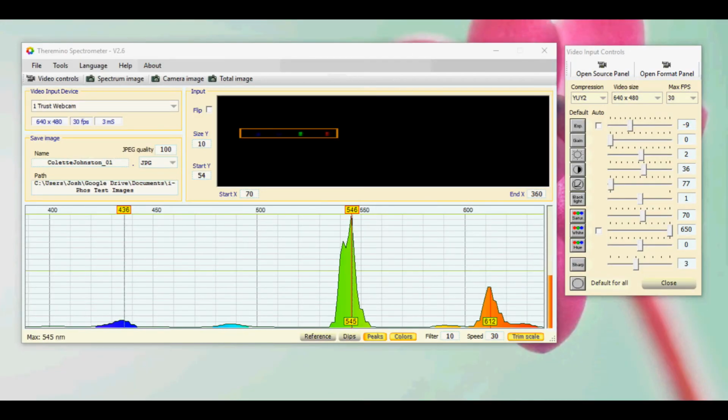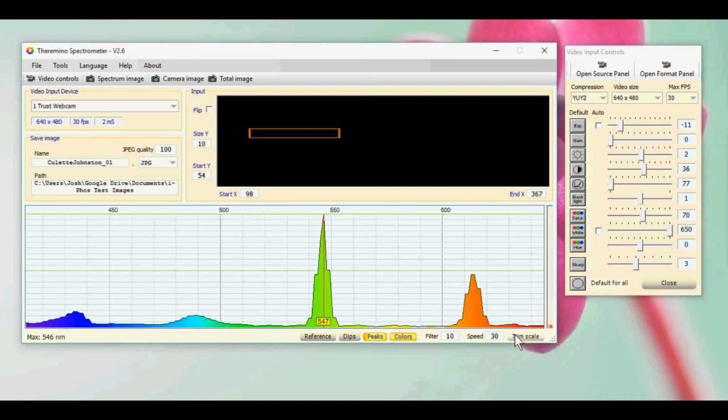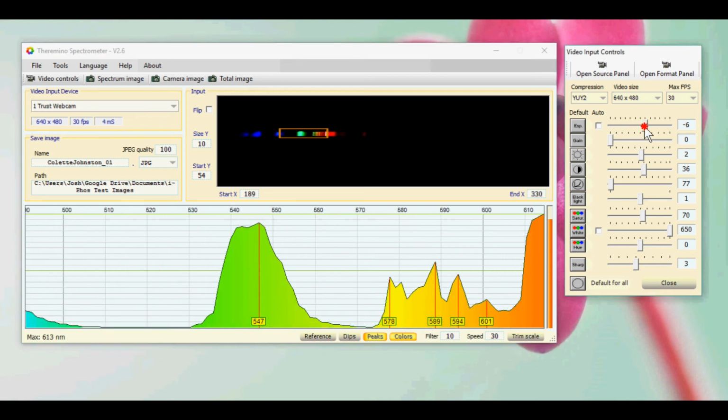So it's important that you line up on the mercury and not the terbium. You'll get an error of about 4 nanometers if you don't do that. That doesn't really matter much in the broader scheme of things, but if you're interested in maximum accuracy, then that's the process. So we zoomed up the exposure to get to the very peak of this lower mercury line. We zoomed down the exposure to see the detail on the higher mercury line. Now we've finished calibration, so we can turn that calibration off and continue to use the instrument as we see fit.